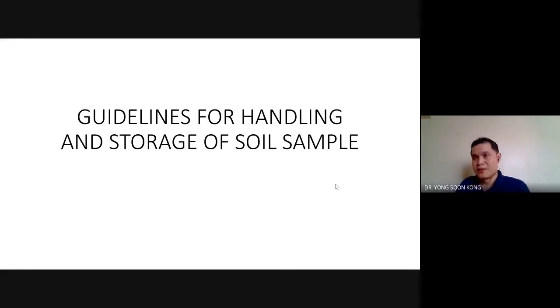Because the main reason why we want to collect soil samples is to analyze their actual content. So changes are what we're trying to prevent. One of the ways we can prevent that is to have good preservation and also storage. For your information, whatever soil samples you collect back, the contaminants there will not stay forever, no matter what type of contaminants. They will change, but you have to know how they change so that you have a better idea of how to analyze, report and interpret them.